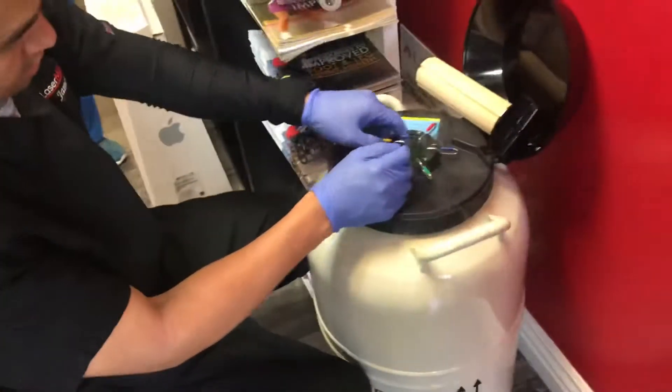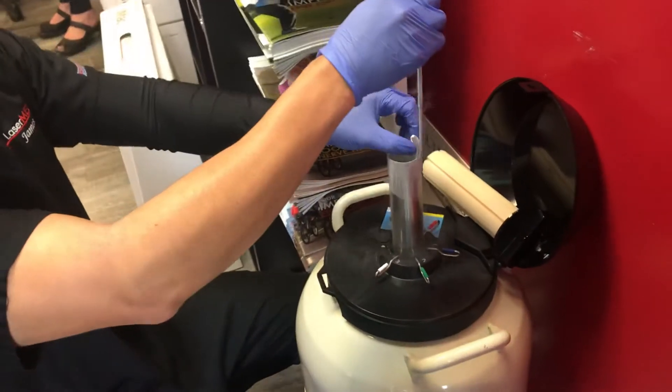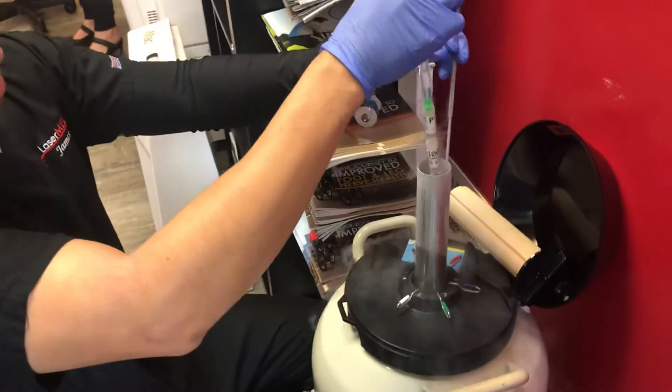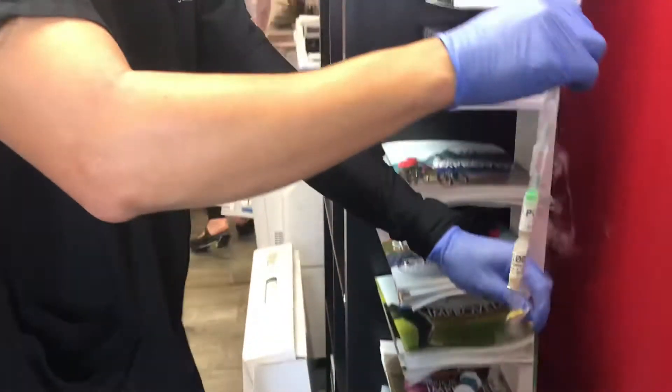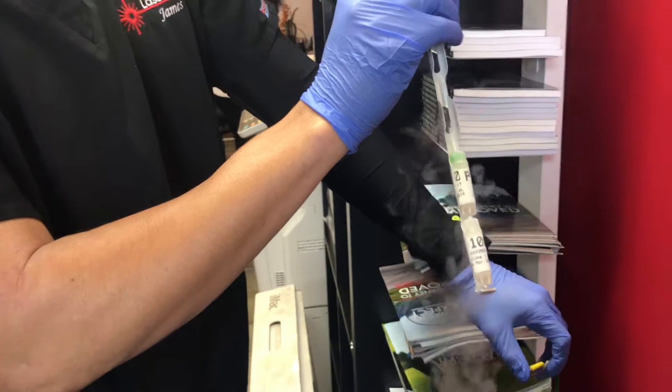Here's where we store the Wharton's Jelly umbilical cord stem cells. We keep them in a cryo-tank at approximately minus 200 degrees, and we fill it up every month. We're going to have one polycyte and one chlorocyte.